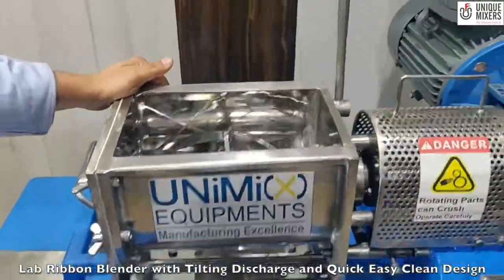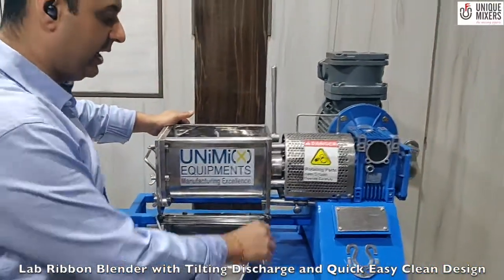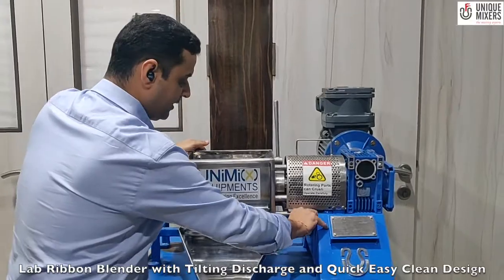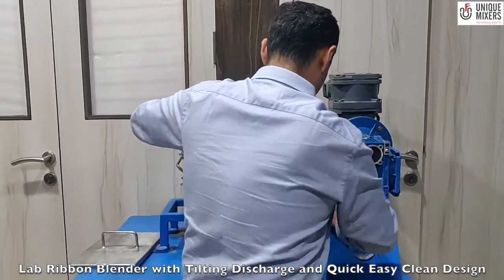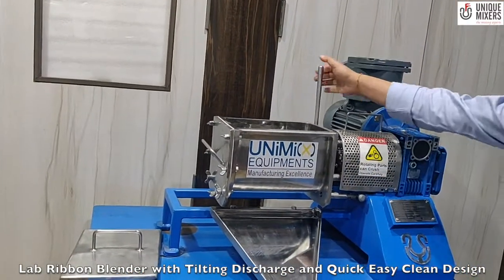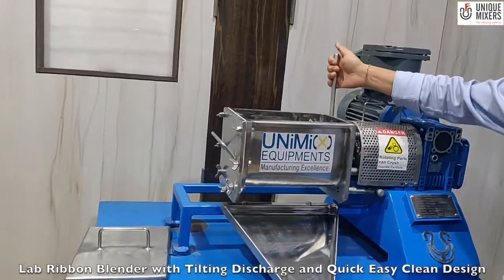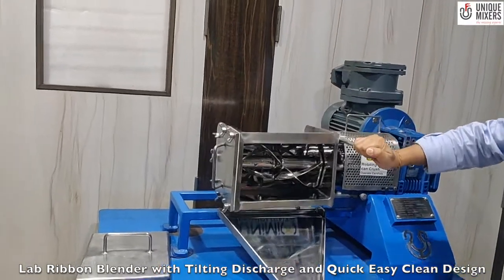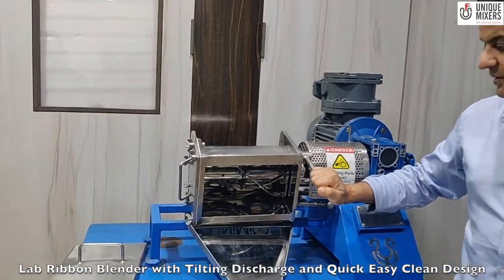Once the material is mixed, it is very easy to discharge by tilting of the container. What we have here is a lock which is provided to ensure that the material is not accidentally tilted. We have a lock in the back as well. By tilting the container, the material simply gets discharged.